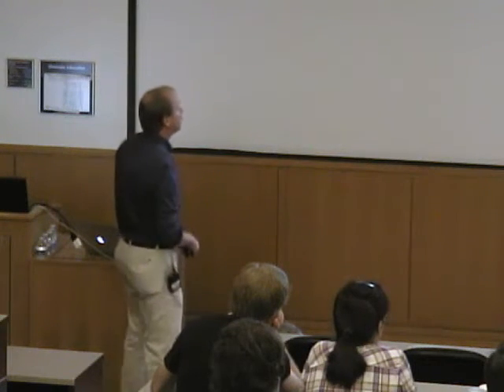And so if we again go back to our rhombogram, iron(III) should be spin 5/2. And if we look at E over D equals 0, our heme has a quite symmetric environment, has roughly 4-fold symmetry. And you can see this matches really well.